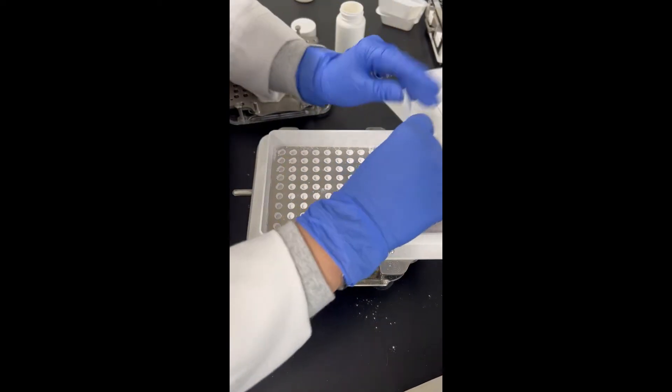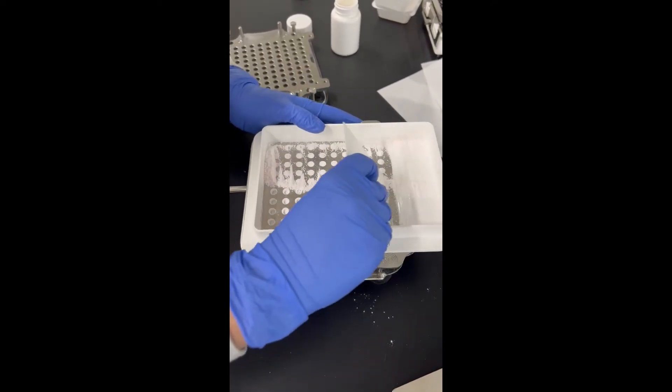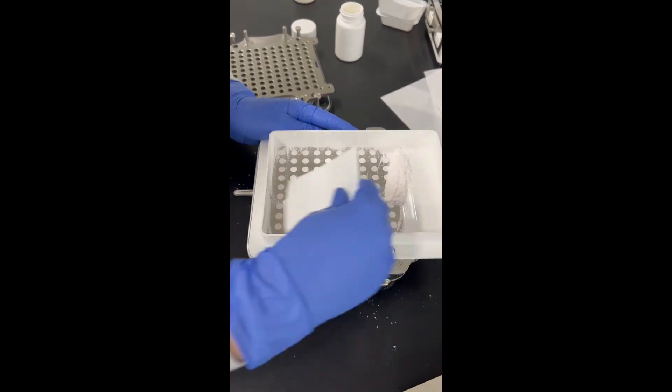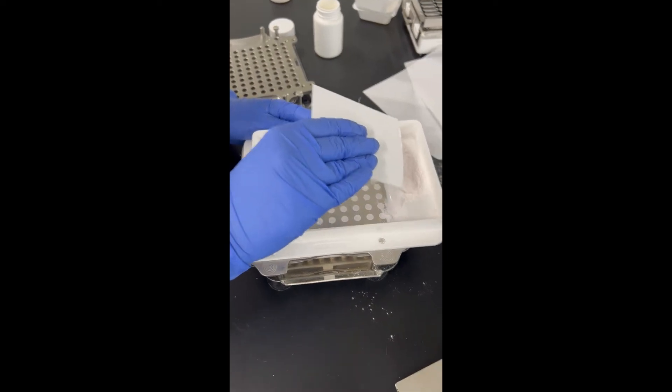There's also a possibility you might have some extra powder left over, because you do calculate for 10% excess — and that's why you calculate for 10% excess.